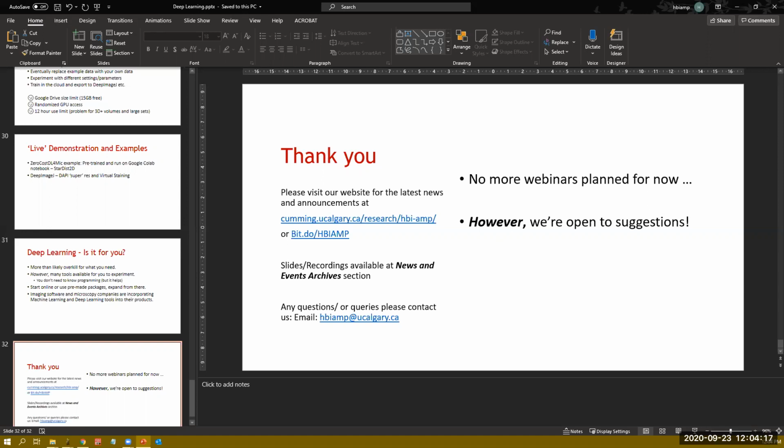Yeah, if I can add something here. Essentially, when you're using, say, a Gaussian filter to average, your Gaussian filter, depending on the kernel size, will affect both your signal and your noise. So your signal is going to be greatly affected, and it's one operation at a time. Versus deep learning might not affect your signal at all, but might just recognize the noise and eliminate it. So essentially, with deep learning, it learns from many features in your image.